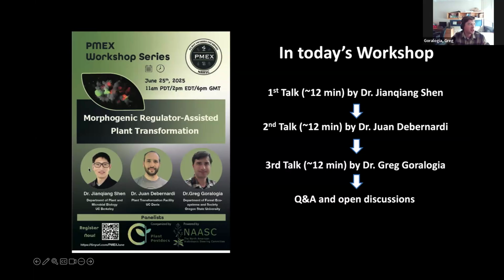But also we noticed that when you change the gene orientation of the auxin and cytokinin genes, it matters. Basically, I think a lot of Agrobacterium are under selective pressure to make the T-DNA smaller because you get increased delivery when you do that. And so that regulon, once it's inserted into plant DNA, you get variation based on position effect, but they're sort of evolved to be in that configuration. So I'm trying not to break it when I do that, or if I am, it better be intentional. We found some interesting things just by changing the gene order.